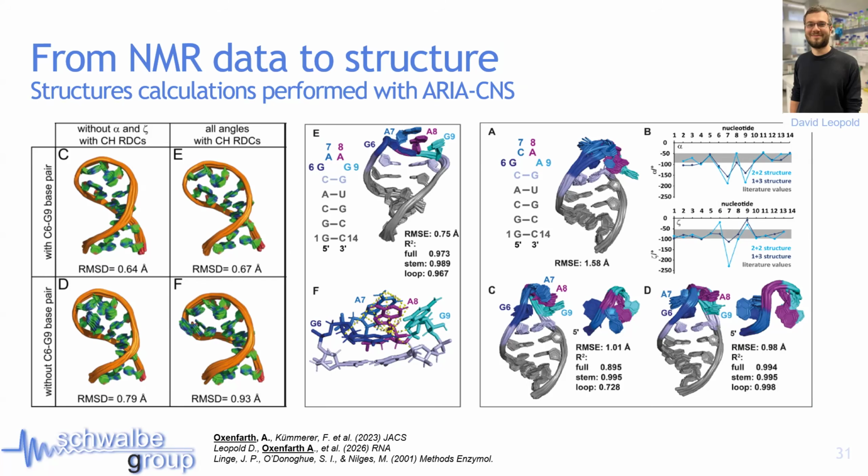For GAAG, actually, and these two RNAs were mostly worked on by David again, here the RDCs look fine. We have a low RMSD. So you could think everything is great, but it doesn't describe the averaging of couplings that we have previously observed. So this doesn't actually fully explain our data.